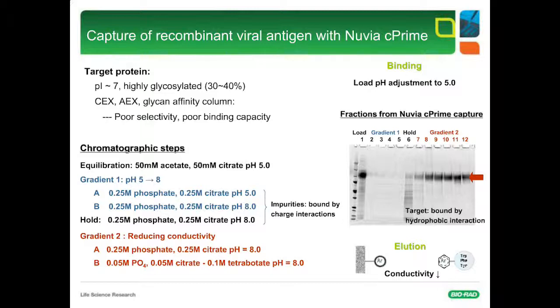There's one question here that I will answer at the end, but I do have another technical question. A person here says that they've used hydrophobic mixed modes before, or other mixed modes. They're not really sure how to quantify the structure, but they've noticed quite a bit of tailing when they're trying to elute from these resins.